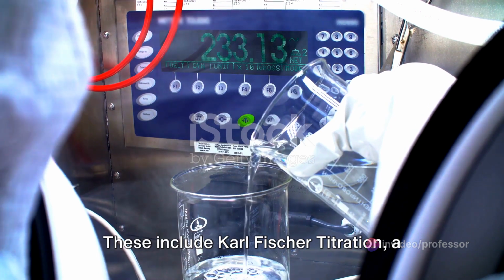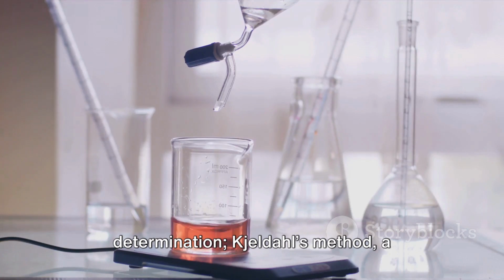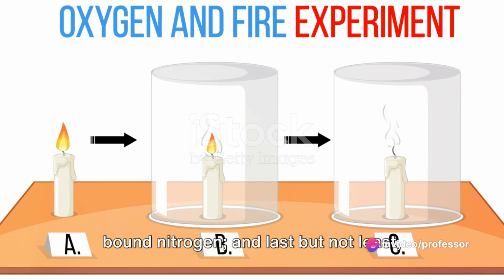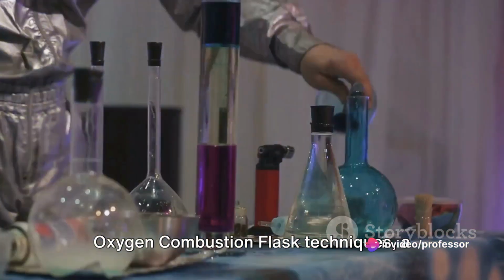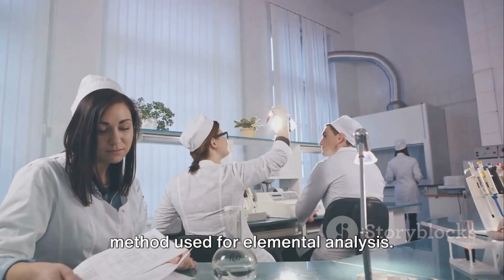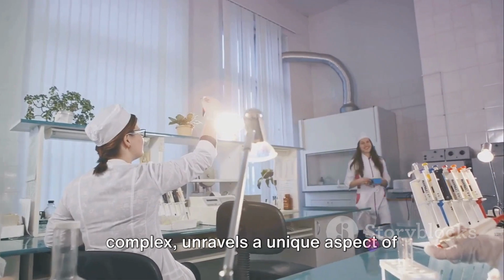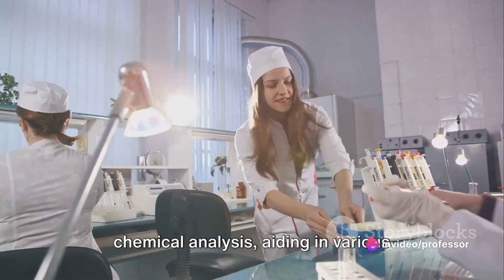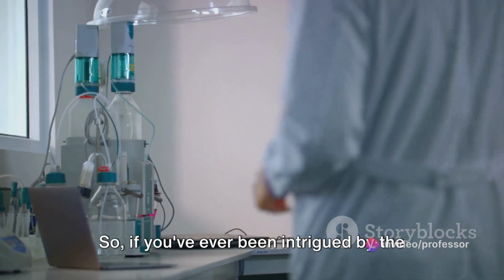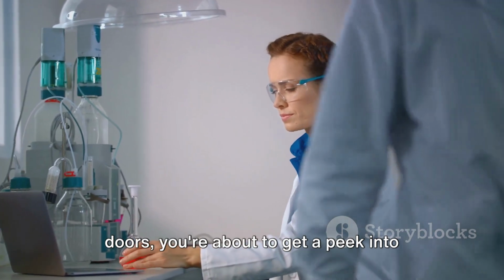These include Karl Fischer Titration, a method used for precise water content determination, Kjeldahl's method, a technique used for estimating organically bound nitrogen, and last but not least, Oxygen Combustion Flask techniques, a method used for elemental analysis. Each of these techniques, while seemingly complex, unravels a unique aspect of chemical analysis, aiding in various scientific endeavors and even in industries. So if you've ever been intrigued by the science that goes on behind laboratory doors, you're about to get a peek into that world.